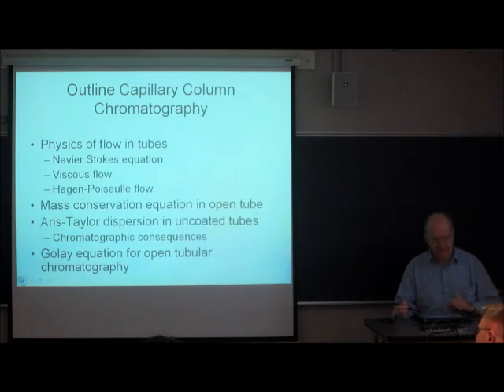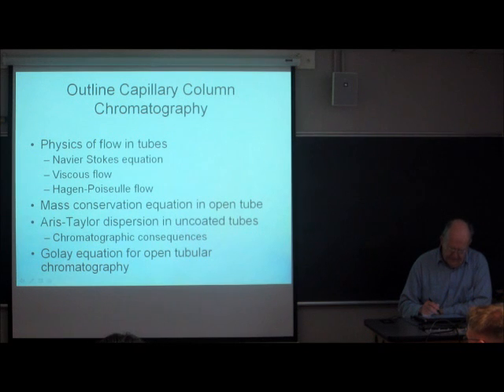Now, in order to understand this device, we have to understand the physics of flow inside a tube. And we're going to use cylindrical tubes. That helps a little bit. People have solved the problem for rectangular tubes and for hexagonal tubes and whatnot, but nobody who does chromatography could care about that. The fundamental equation of flow in general is known as the Navier-Stokes equation.